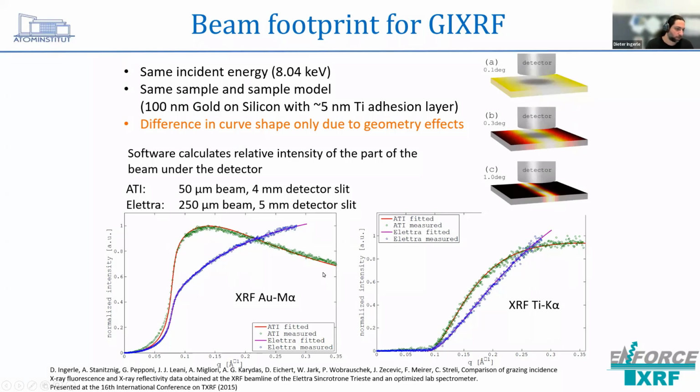It looks quite distorted because at the higher angles, we're losing intensity, and this can again be explained if we look at the beam footprint on the sample. As you can see here, it's just shrinking, and if the beam is too small, then we just lose intensity, compared to the theoretical calculation without any corrections.